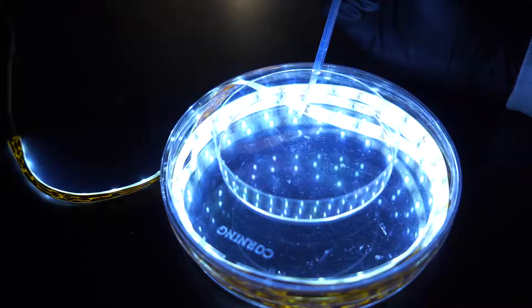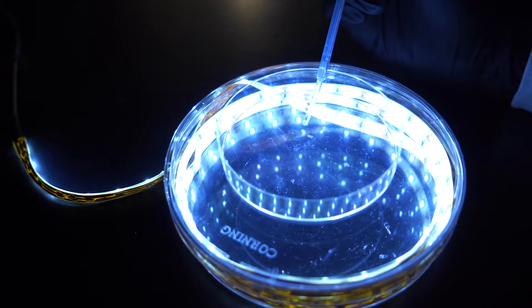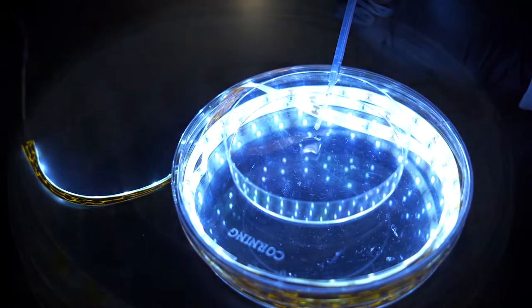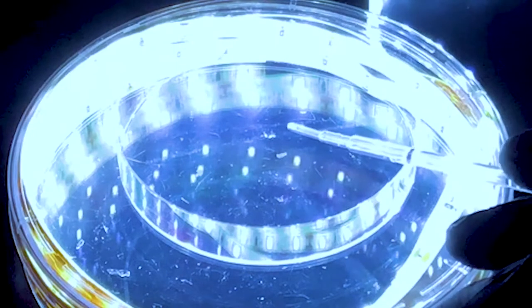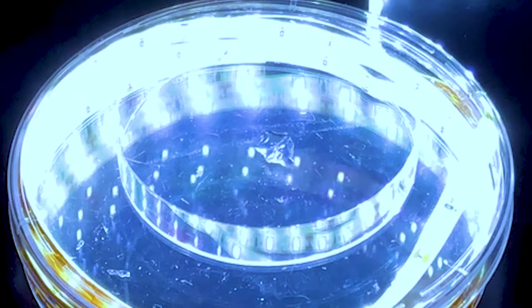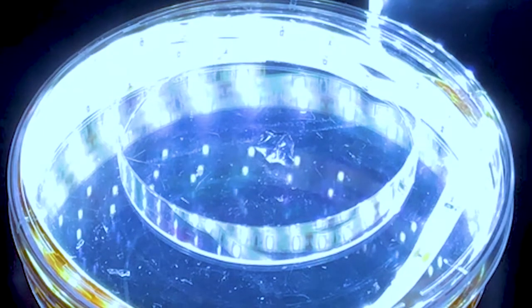Expansion microscopy is an emerging imaging technique that allows you to see very fine details of biological specimens. Basically, you take the biological specimen and infuse it with some chemicals just like baby diaper materials, and then you add pure water on these chemicals and it will enlarge a hundred times in size along with the tissues.